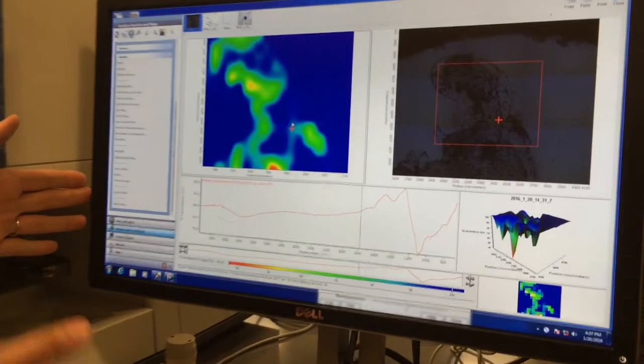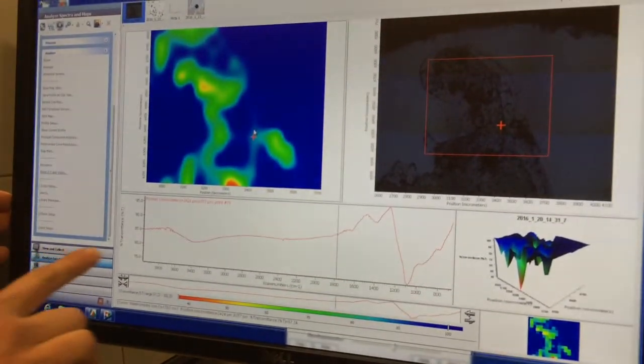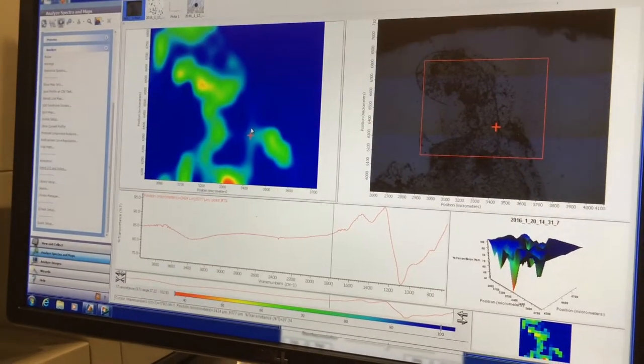What we're seeing here on the screen is a basic layout of one of the mapping features, as well as some of the spectra generated from the sample from inside the crab.